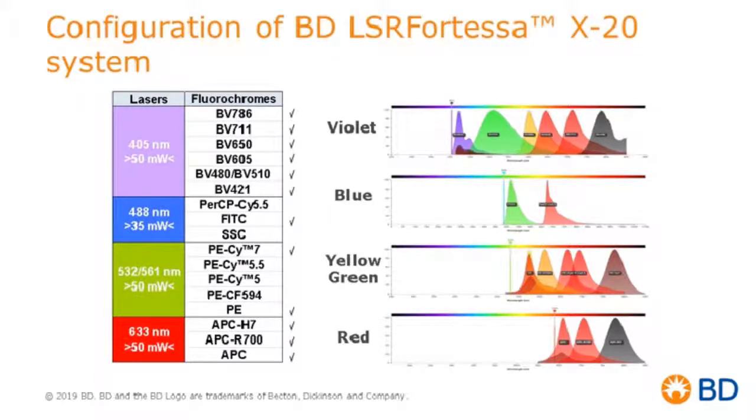As is illustrated here, the check mark is the fluorochrome that we have utilized. On the right hand, it illustrates the spectra that we have available and how all the different lasers and dyes excited by the different lasers fill the space and eventually are utilized for designing this panel.